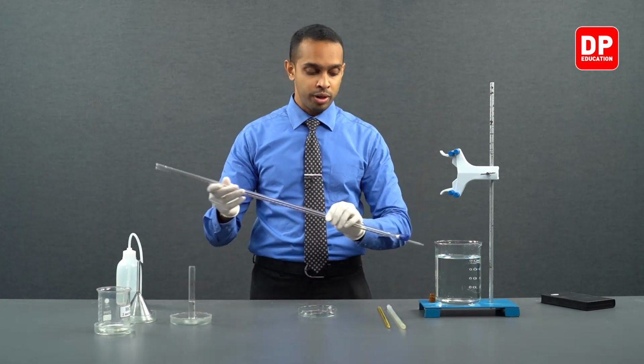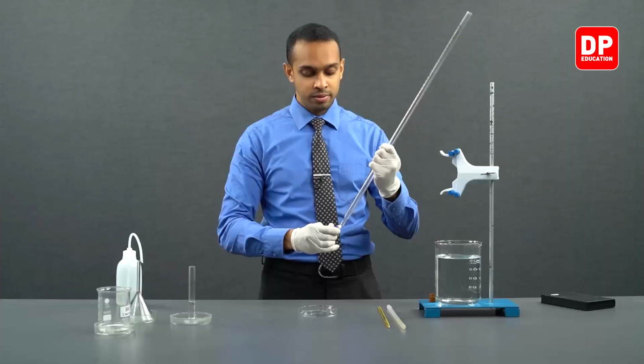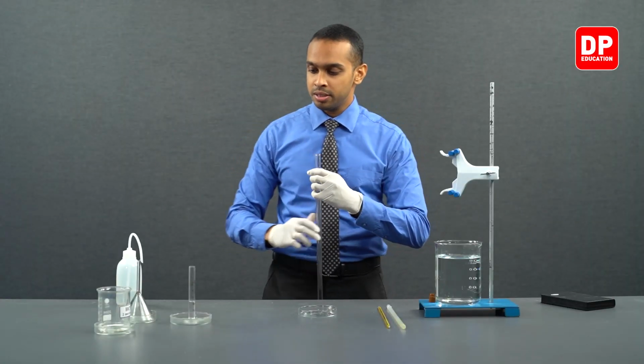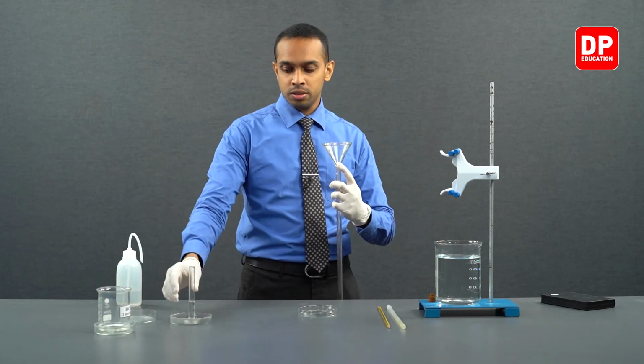let's take our burette once again and make sure the burette is tightly closed. After ensuring it is tightly closed, let's add the HCl that we measured into our burette.